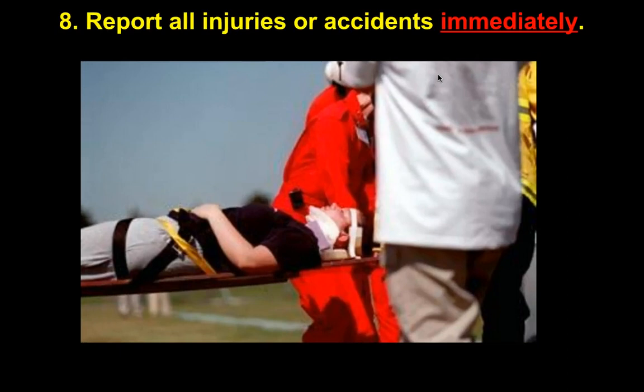If you ever get injured or have an accident, let your teacher know immediately. We've had kids in the past not say anything, and then the principal came down asking what happened to a student — their parent had called saying they got burned, and we never knew because the student never told us. So if you think it's bad, let us know right away. Otherwise we have no way of helping you — getting you ice, putting it under water, or getting it disinfected.